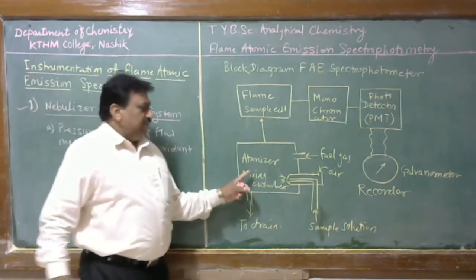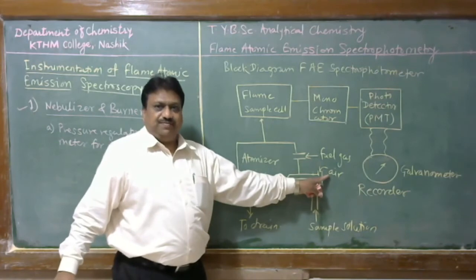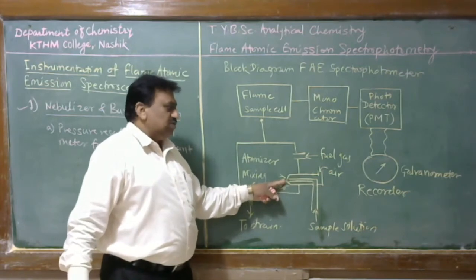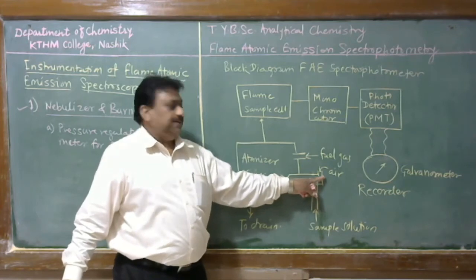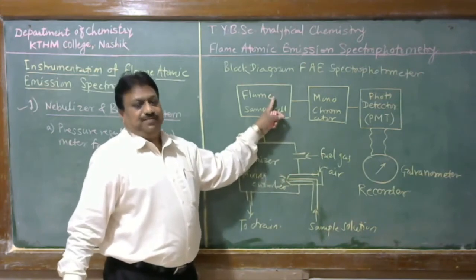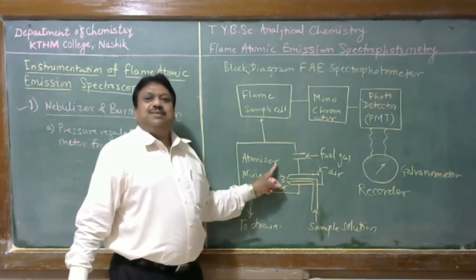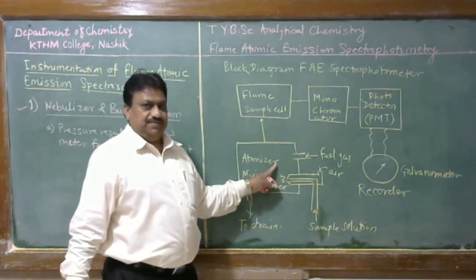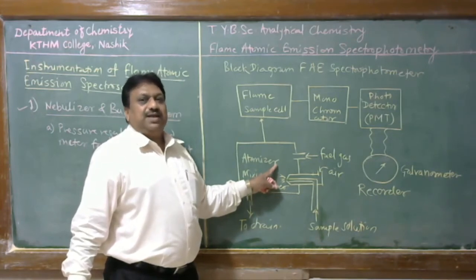Now in this block diagram, you will observe that there is an inlet for fuel gas and an inlet for compressed air. Here the sample is taken through this capillary in a solution form by using this compressed air, and this effect is called the Venturi effect. Here fuel gas provides fuel for burning of the flame. Therefore, good and reproducible results are obtained with a properly burning flame.